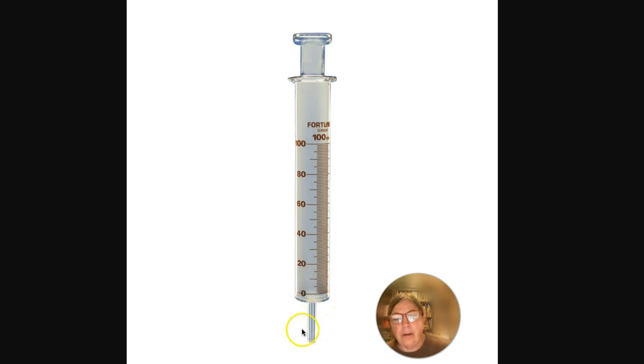Then you connect all the plumbing. You connect this thing to the gas gauge. And you read the pressure, which should be about standard pressure, because it was just air that came in from the room and entered the syringe. Then you pull back on the syringe to 20 milliliters. It's the same amount of gas, because you're not letting any more gas in after you connect to the gas gauge.